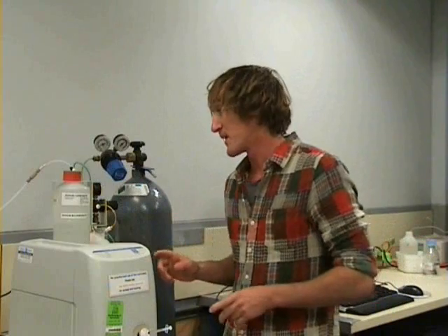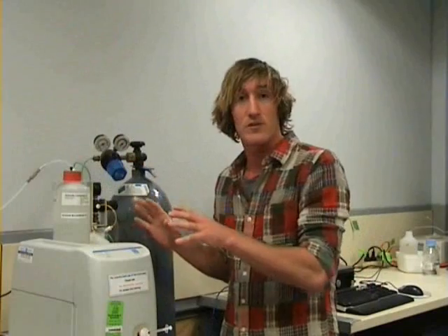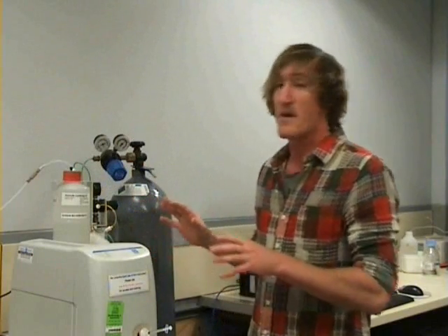Our mobile phase is responsible for carrying our unknown solution through the chromatographic column. Depending on the pH, concentration, and type of mobile phase will determine how our sample is separated in the chromatographic column. Usually this is all set up for you previously before the lab, so you don't have to worry about the concentration or behaviour of the mobile phase.